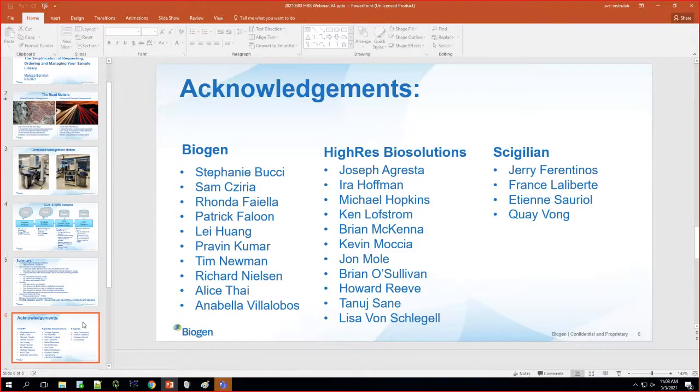Every time, I forgot to point this out in the demo, every time that something is removed from that source plate, some compound is removed from it, it's reported back to the database what the new sample volume is. So let's say that you removed 300 nanoliters from 10 microliters, then it reports back that you now have 9.7 microliters in the well. The other thing is that, as you know, the ECHO does a survey before it does the transfer. And so that survey volume is populated back into the database. So you always have the most recent snapshot of what is actually in the plate. And there's a tool in store where, if you're worried about plates getting low, you can ask it to show you how many plates have volume less than 2 microliters so that you can start replenishing these samples across your collection.